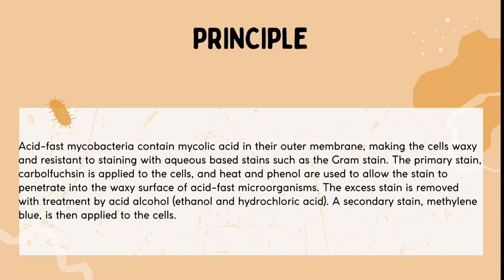This means that once the bacterium is stained, it cannot be decolorized using acids routinely used in the process. This important and unique feature of certain bacteria gives the ability to classify and detect them using relatively easy laboratory procedures such as microscopy.